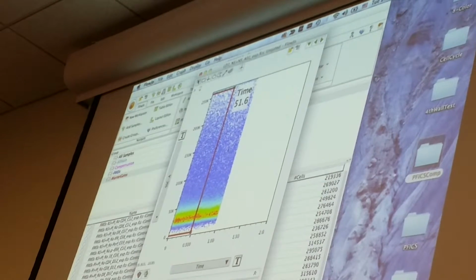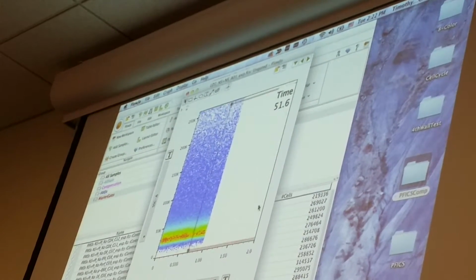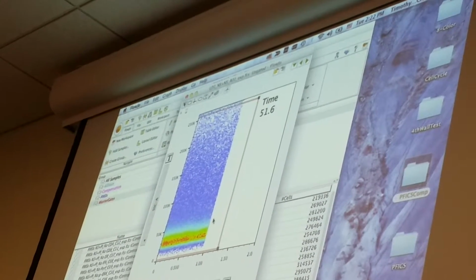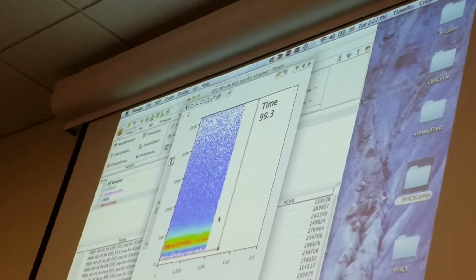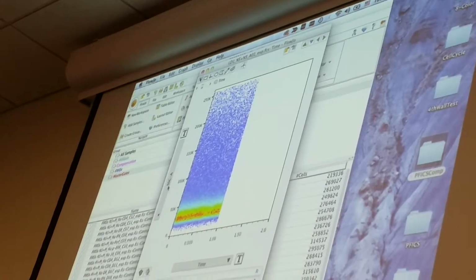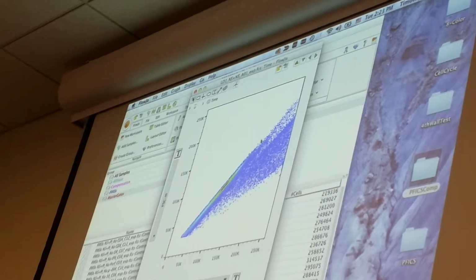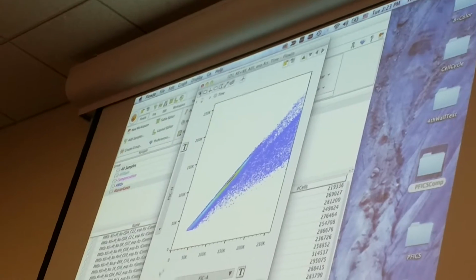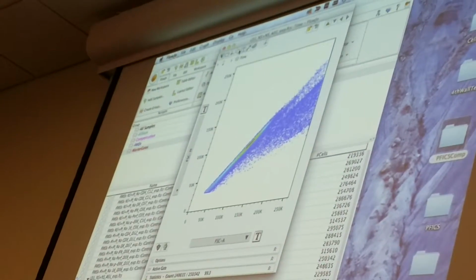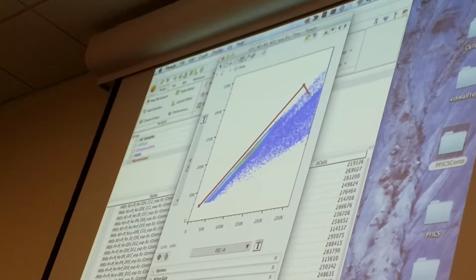And usually side scatter shows the drop in pressure when you get a clog really effectively, so I can cut off bad sample and preserve at least some of my tube for analysis. So I start with a time gate. That's totally optional. And then I go to a forward scatter height versus forward scatter area. If your machine is set up, you have a nice diagonal between those two parameters, and what I'm doing here is going to take the cells on the diagonal, which are the singlets.